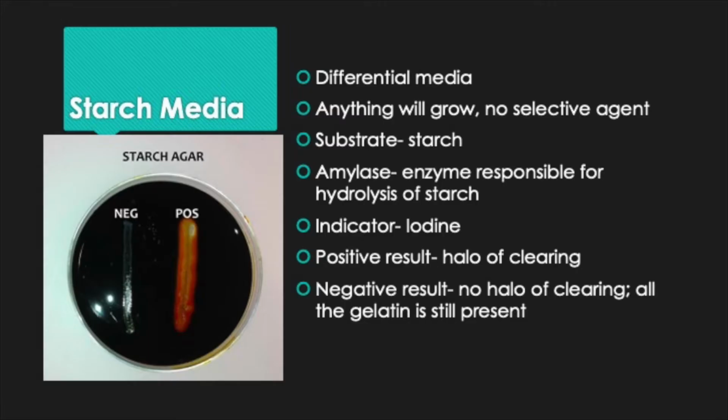All right, so the next media that we are going to look at is called starch, okay? And this, again, just like the gelatin, is a strictly differential media, and it's looking to see, can the bacteria break down or hydrolyze starch? Okay, can it eat starch, yes or no? Now, starch is a polysaccharide. It's a sugar. It's a very large sugar, okay?